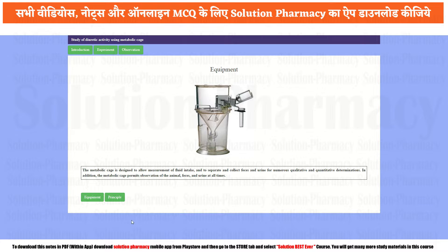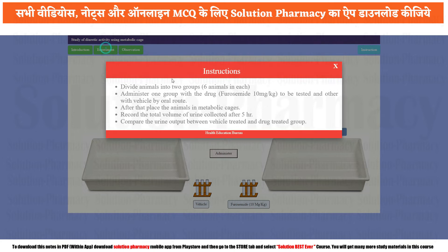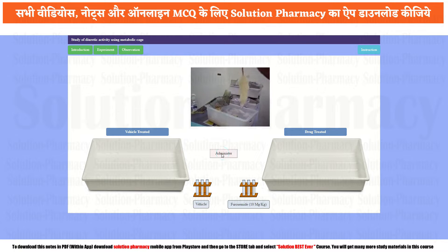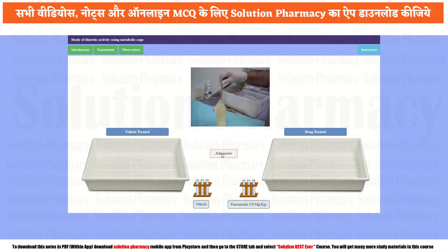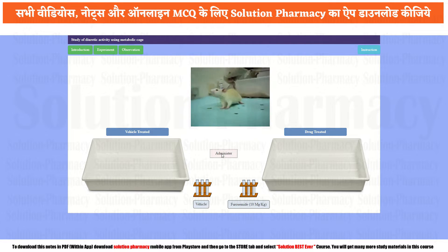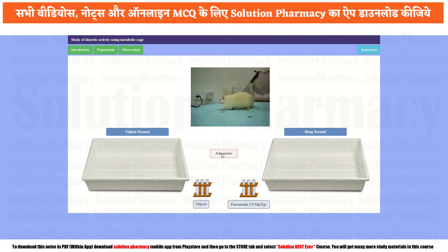To start the experiment, click on the experiment tab section. Now it shows the procedure — you may take a screenshot of this video to use it as a reference. Close it and now start the practical by clicking on the administer button. Once you click the administer button, a small volume of liquid as well as the drug will be given to the respective group.